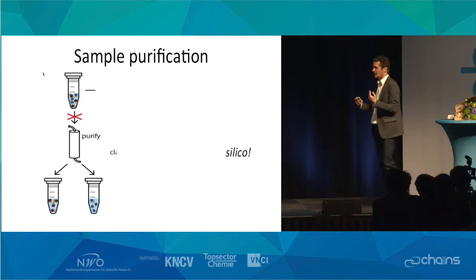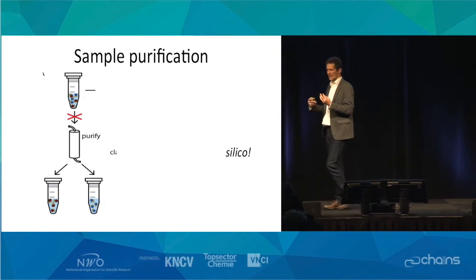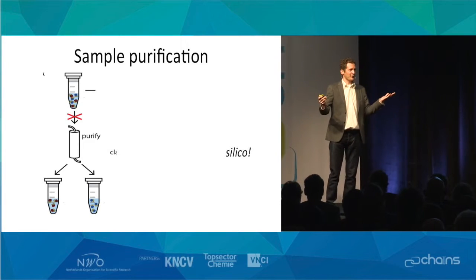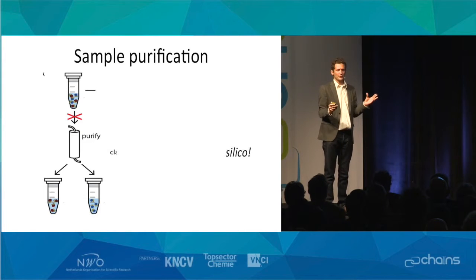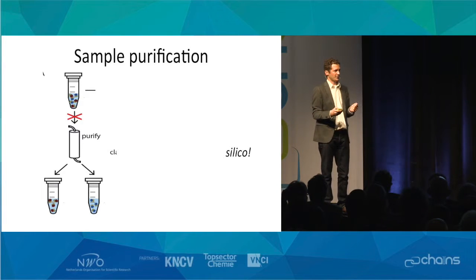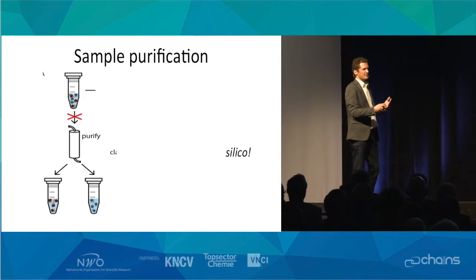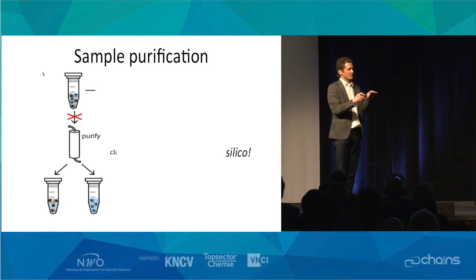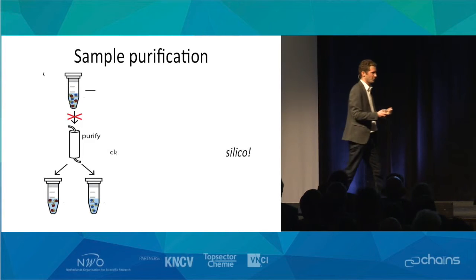And to some extent, that opens very exciting possibilities where if you have mixtures, the classical structural biology approach would be the biochemical one, where you use biochemical purification to separate distinct structures out into two different samples on which you would do structural biology or biophysics experiments. To some extent, we can now circumvent that by actually imaging mixtures, as long as in the computer we are able to separate out the distinct structures. We can get structures of all of the different 3D states from one single experiment.